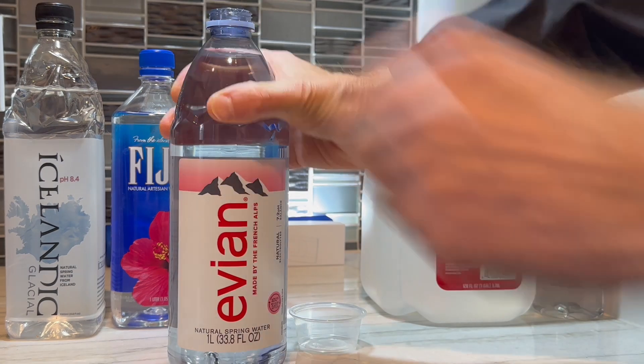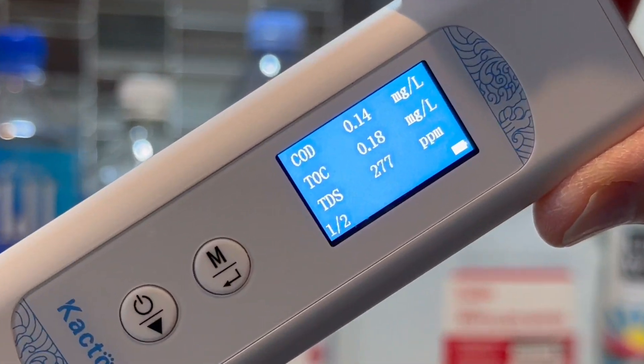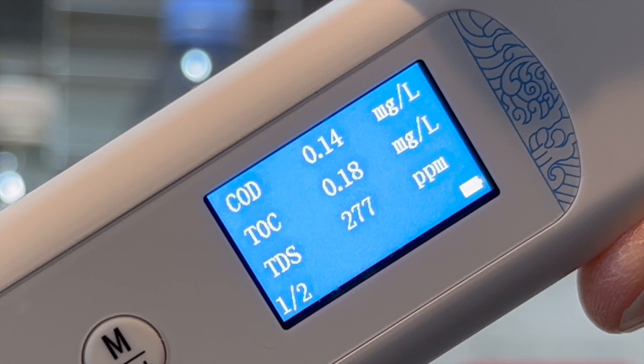Evian is sourced from natural spring water, so I'd expect it to have some dissolved solids. Hey, check it out — the TDS measures 277 parts per million.